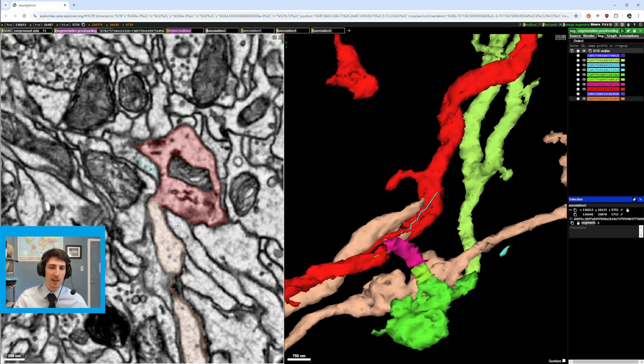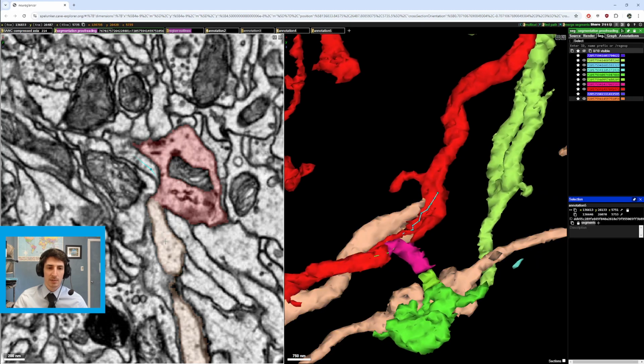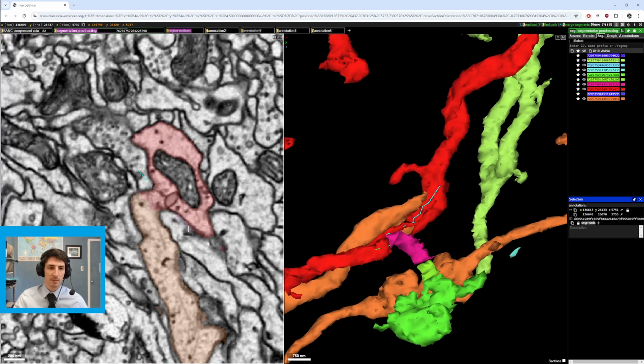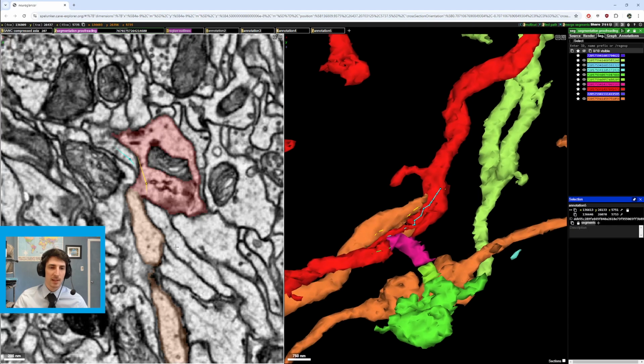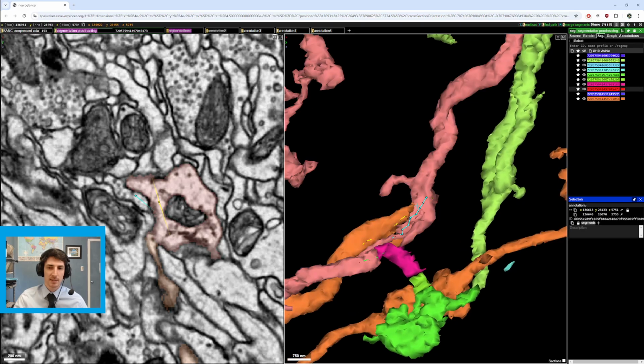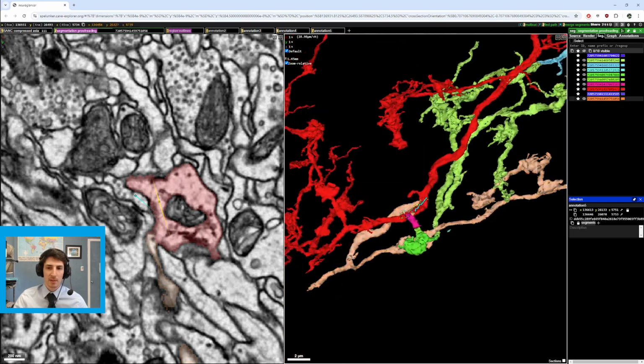So we could say, okay, let's see which one it is. Is it over here? Where'd the point pair go? There it is. Okay, so that point pair, the yellow path, is good. So this connects to that. That's good to know.